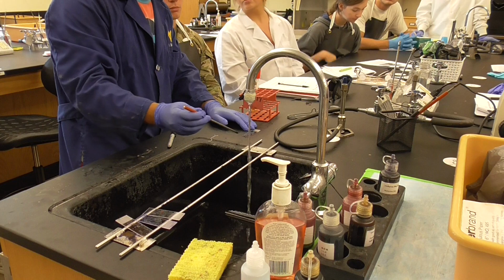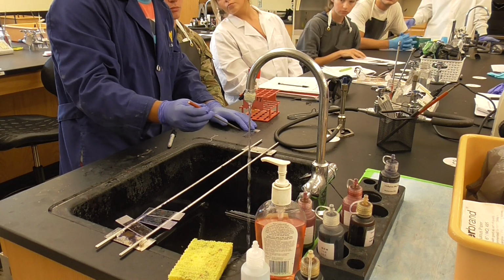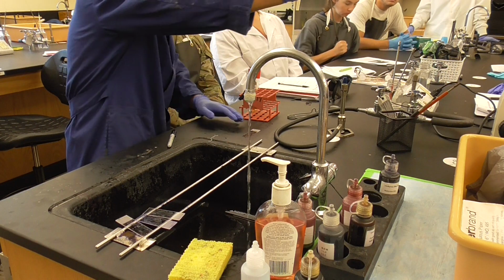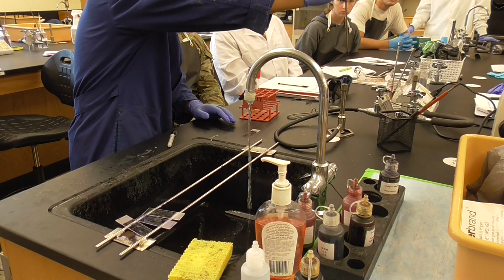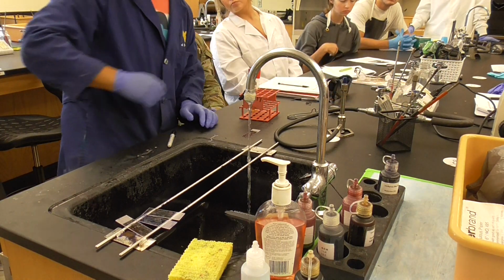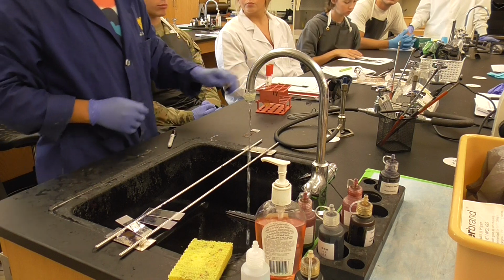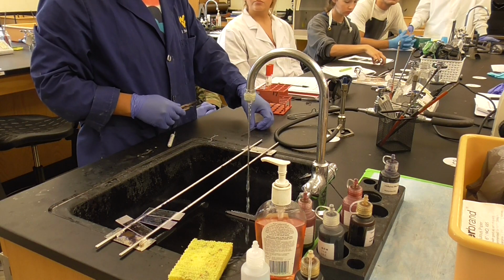And then make sure it is mixed very well. Okay, then you flame it again. Okay, now what you're gonna do is the air dry. Air dry is about 3 to 5 minutes. Okay, let's say the air dry is fixed.